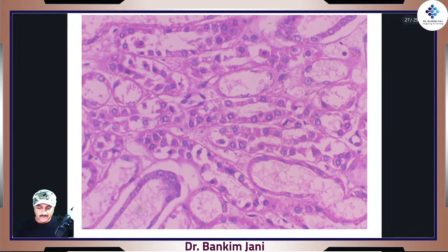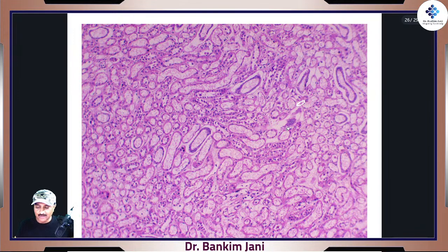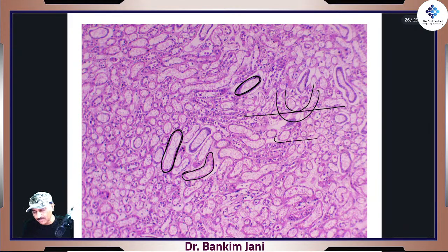Thank you. Good one. Now we go back. Now see, so many. Now we see so many collecting ducts. Correct? Bigger ones, yes, very rightly said. Some of them are not rounded. See this one, an elongated one. But now you know the reason. Why is the tube an elongated one, why is it this odd shape? Because that section might have gone through when it was taking a turn, and it went through this level. So obviously it would look like this, elongated. Correct?